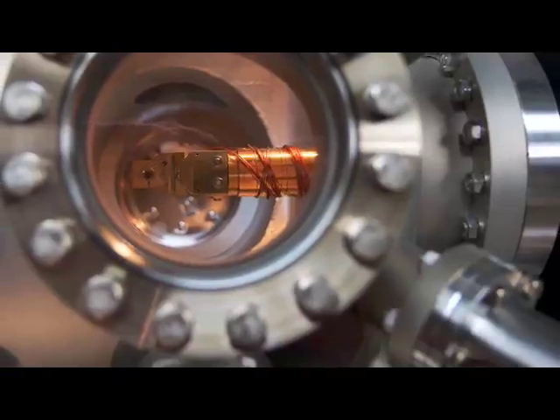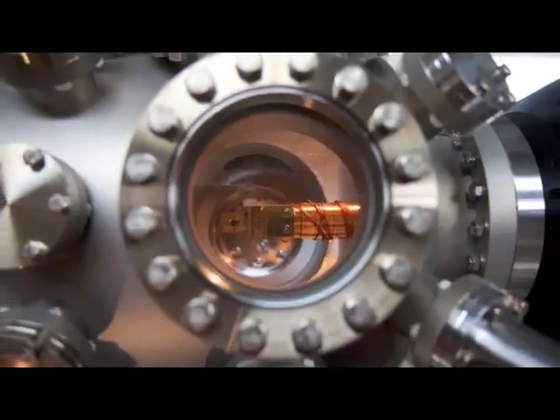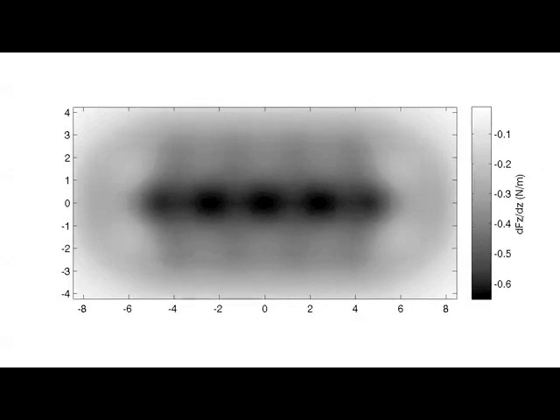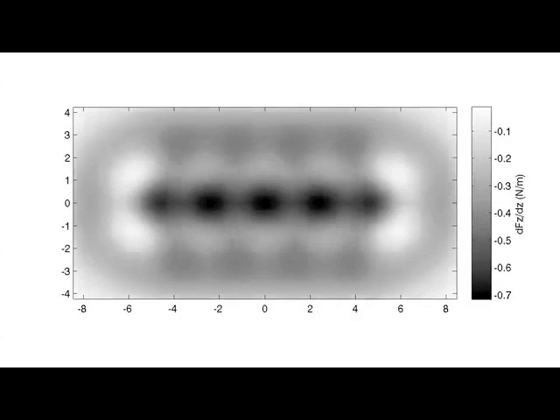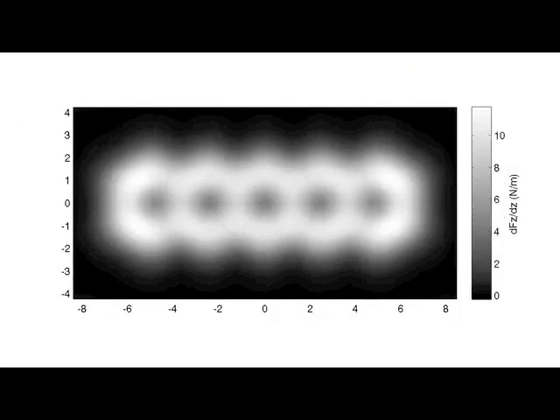To corroborate the experimental findings and gain further insight into the exact nature of the imaging mechanism, IBM scientist Nikolaj Moll performed first principles density functional theory calculations. He comments, "The calculations helped us to understand where the contrast came from, and we saw that it was a quantum mechanical effect, the Pauli repulsion, which gives the contrast. In this animation we see a frequency shift in dependence of the height of the CO molecule over the molecule, scanning from large heights to small heights."